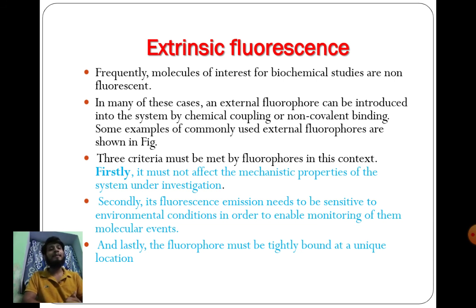For making an extrinsic fluorescence molecule, three criteria must be fulfilled. Firstly, it must not affect the mechanistic properties of the system under investigation.